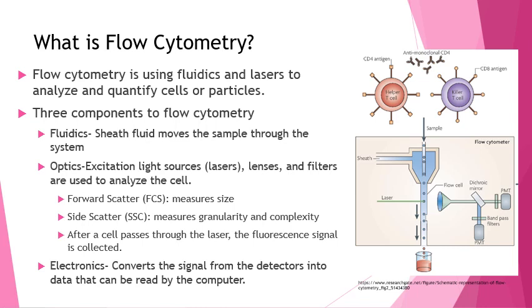Following the optics system is the electronics. So this is what converts the signal that the instrument is reading into a computer or software so that we can then analyze the data and understand what the data and the lasers and all that stuff is telling us.